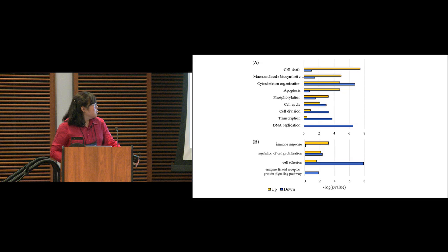Further, he investigated the proteins up- and down-regulated in terms of component. A large number of proteins were up and down, since a large number of glycoproteins were identified. Compared to luminal versus basal, proteins involved in cell death and apoptosis, etc., were actually increased in the luminal cells compared to basal. The down-regulation of proteins, shown in blue, shows another reverse phenomenon, for example cell adhesion, etc.